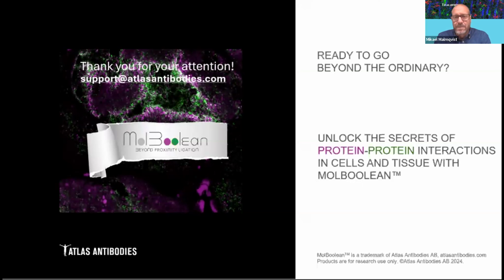Okay, moving down the list of questions here. The MolBoolean images are characterized by single or dual fluorescently colored objects, which requires more advanced image analysis. Could you comment on the image analysis that is carried out to separate single from dual fluorescent objects? And are there any alternative approaches in the pipeline? Yeah.